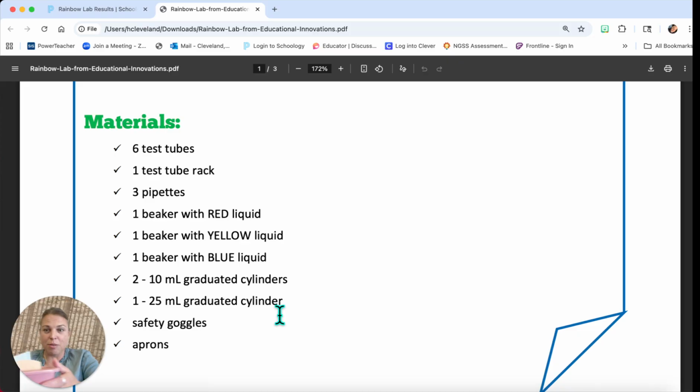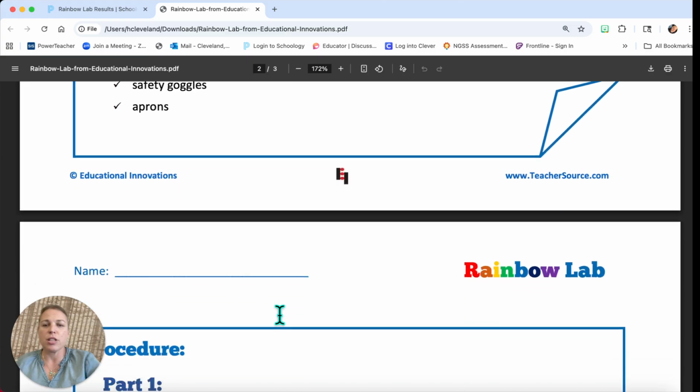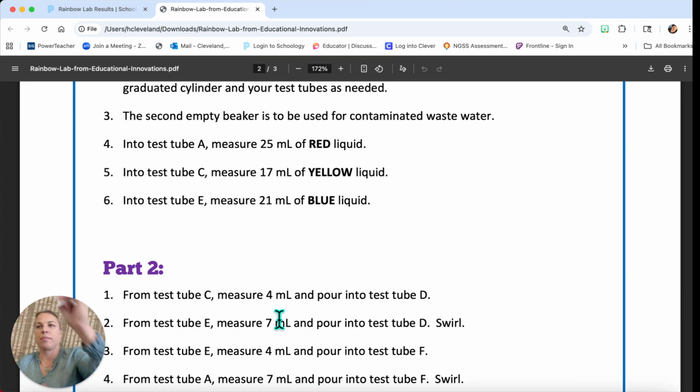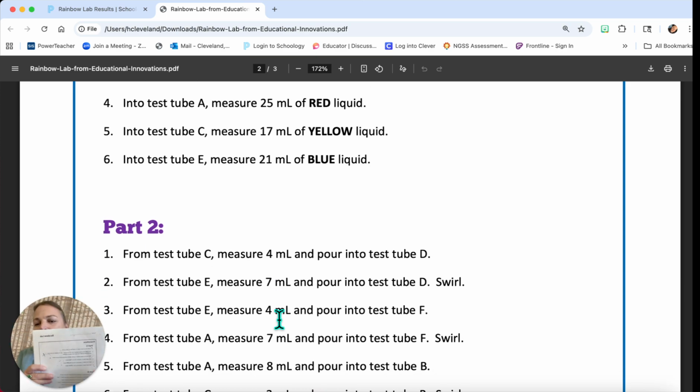I like giving my students a bucket with all of their supplies. This can be a little bit dangerous walking across the room to the sinks and such, so moving it in our bucket is useful. I also provide a calculator, and I take the directions that you're seeing here and I give them to the students in a plastic coated paper.